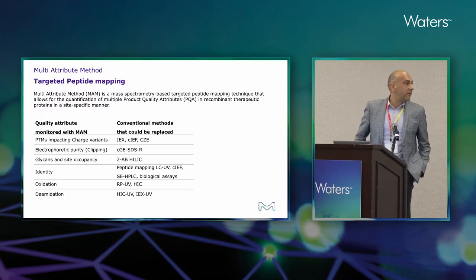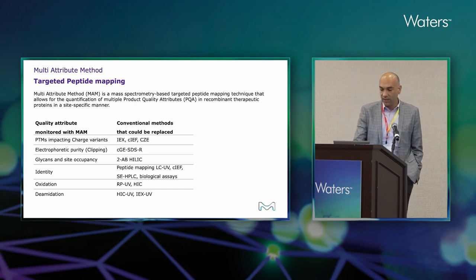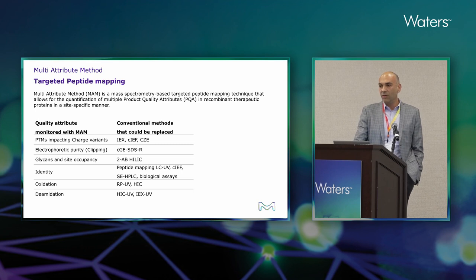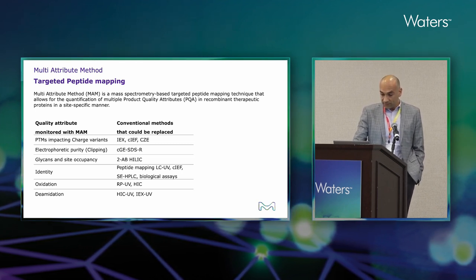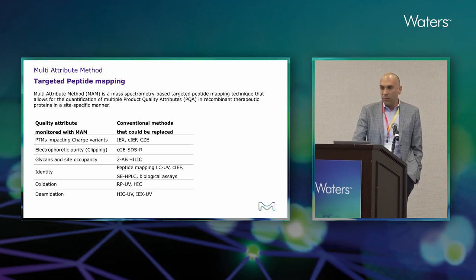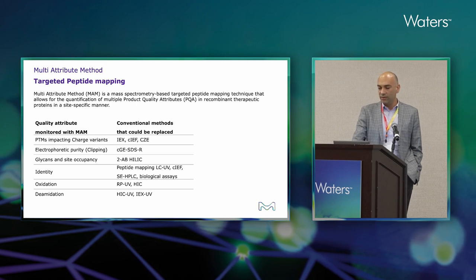MAM was introduced with a well-known publication in 2015 by Rogers. I'm pretty convinced that all biotechs have been using this, but as far as filing with MAM in GMP release, to my knowledge there are not that many except Amgen and maybe a few others. So I will be talking about, in my opinion, what's blocking us from putting this method in a regulated environment.